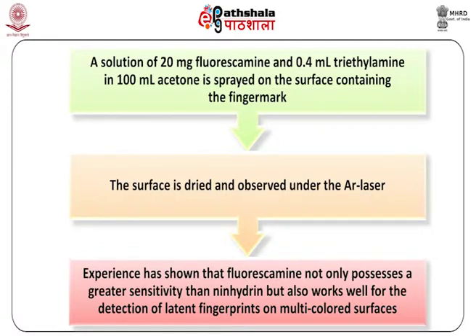Experience has shown that fluorescamine not only possesses a greater sensitivity than ninhydrin but also works well for the detection of latent fingerprints on multicolored surfaces.